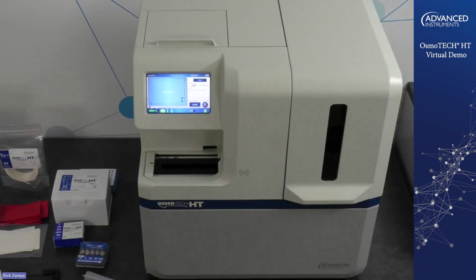You're always going to have a dead volume, an extra volume in the sample, and then you have to assure that you have enough sample. So we want to have 180 microliters in there so that we're assured we have plenty of sample to run those 3 tests out of the well. So I would say it's 180 microliters is required. I will check into the manual and find out why the manual is different because I know we've been using 180 all along.